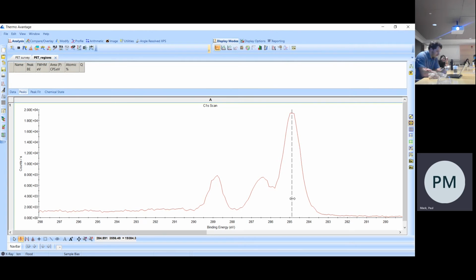results. And there's lots of talk at the moment in the XPS community about the quality of peak fitting and data interpretation in the literature. So making sure you get your peak fitting the best you can is a good thing. Now we're beginning with a really easy example. When we peak fit this, you'll wonder what all the fuss is about because it's so easy. But then we'll look at some that are a bit more complex.